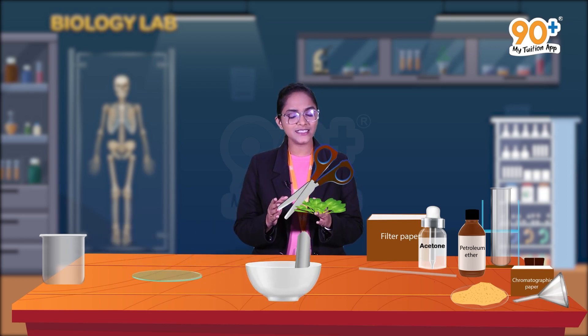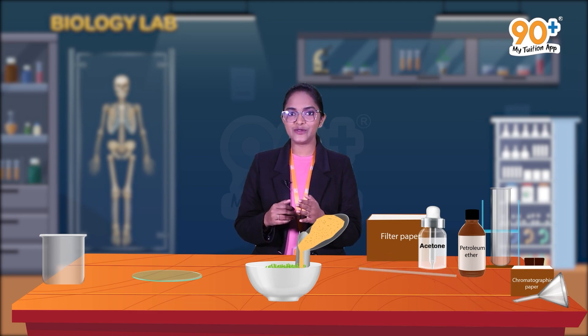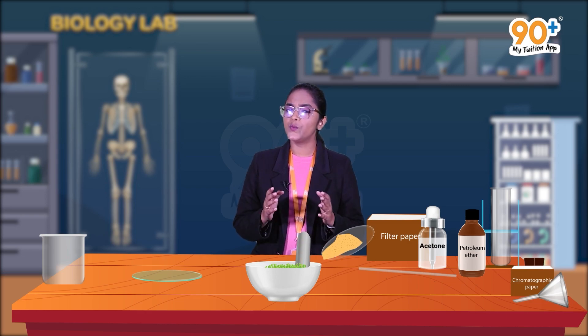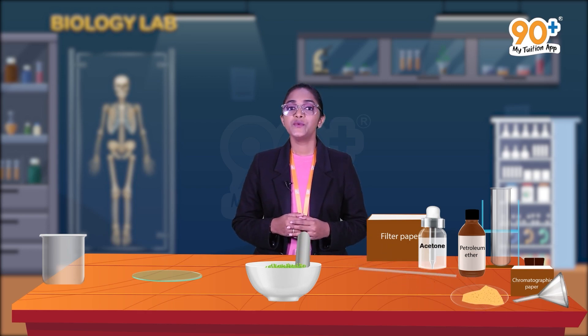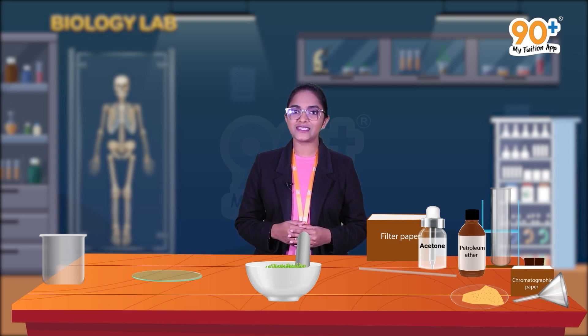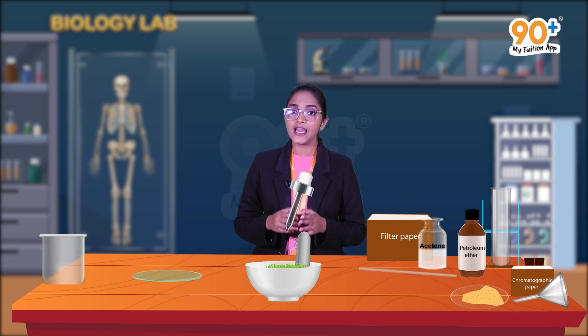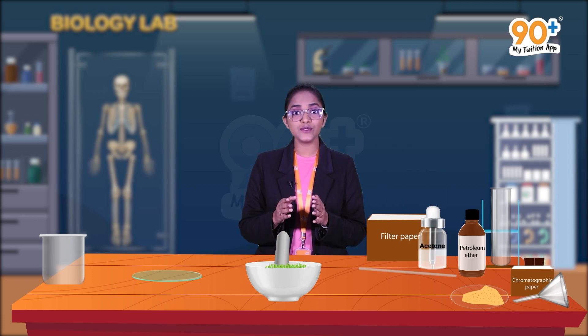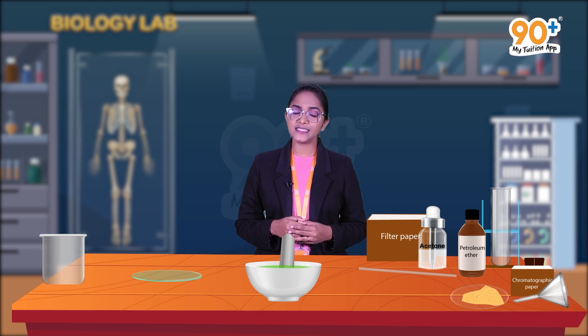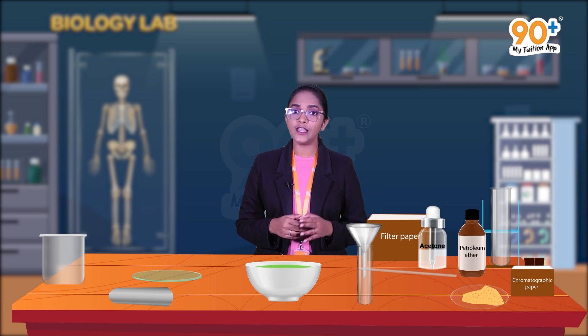Now let's move on to the procedure of this experiment. First, take some spinach leaves, cut them into small pieces, and keep them inside the mortar. We will also add some sand — we add sand with the spinach leaves for the perfect grinding of the leaves. After this, add 5 ml acetone into the mortar and then grind the spinach leaves using the pestle.